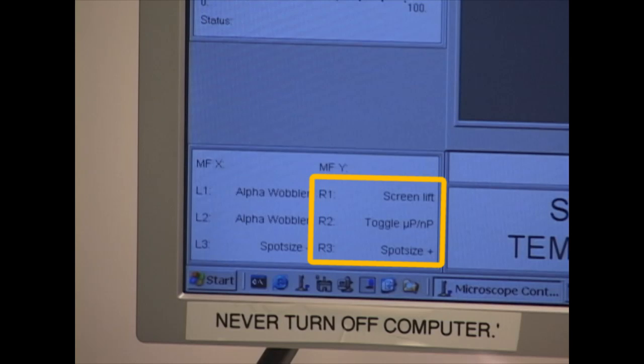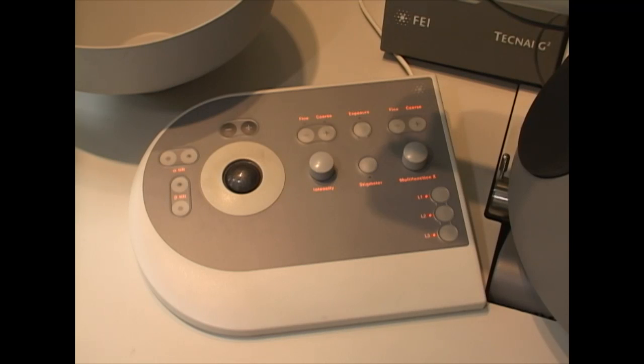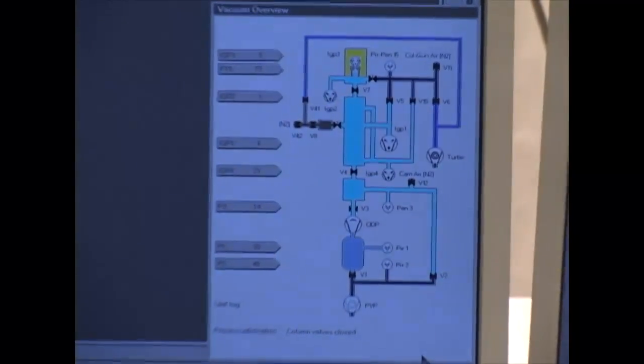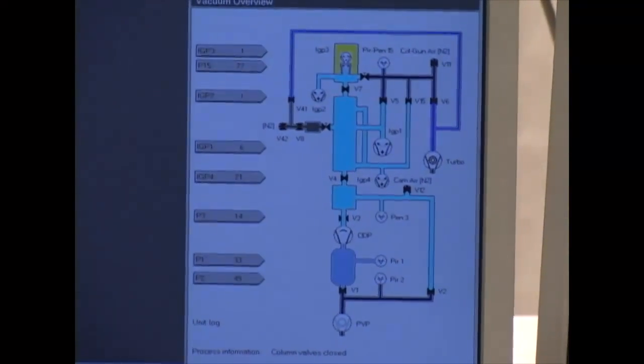The lower left box with L1, L2, L3 reflect the left control panel, and the R1, R2, and R3 shows the state of the right control panel. The multifunction controls are used for several functions in different modes. In the right bottom box, select Vacuum Overview to show the status of the vacuum system and valves.